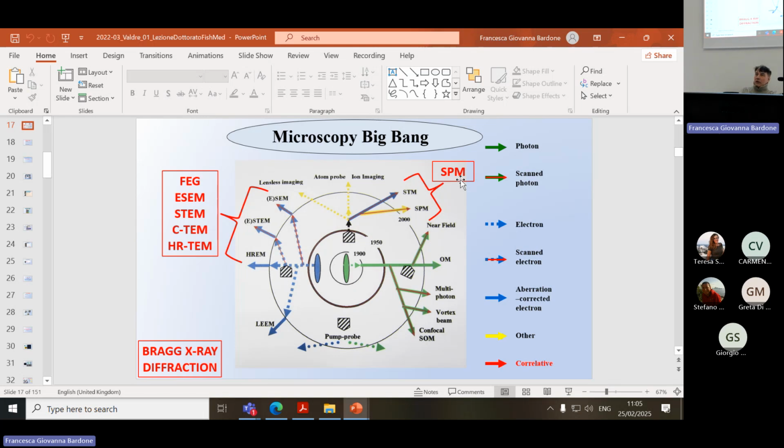When you use electrons, you are an electron microscopy user. You use electrons to create the information. The electrons can be scanned, so it's scanning. The electrons can be transmitted, so it's transmission. The electrons can be reflected. So there are different types of electron microscopes. All these in this slide are microscopes, instrumentation where we try to enlarge an information. But remember, always be connected to the resolution.